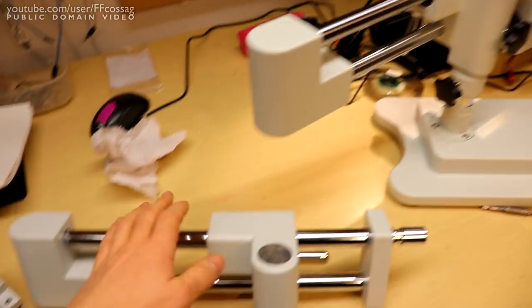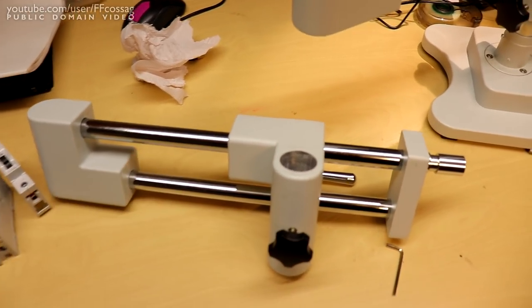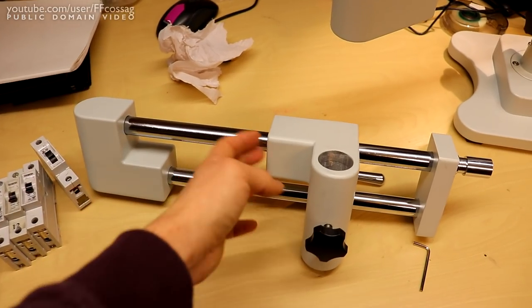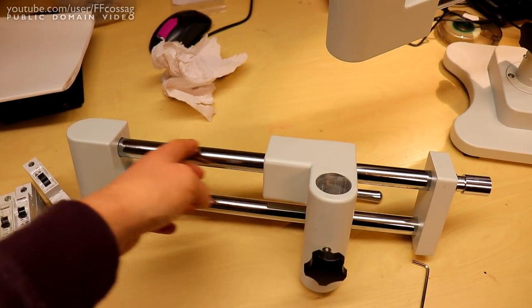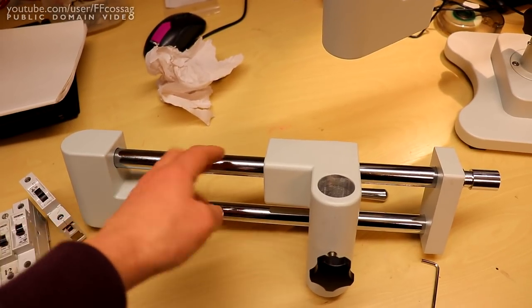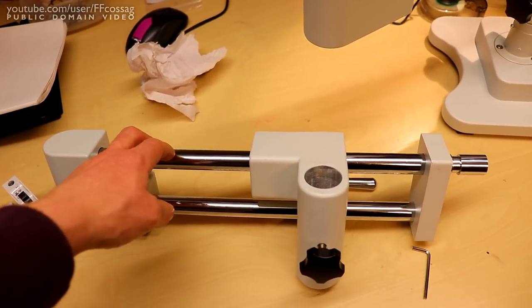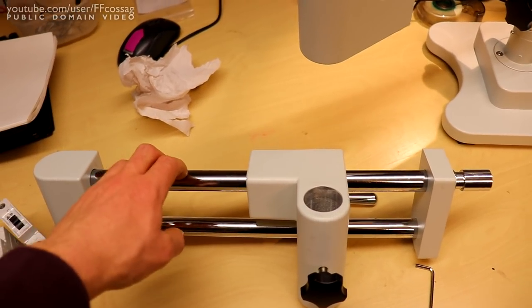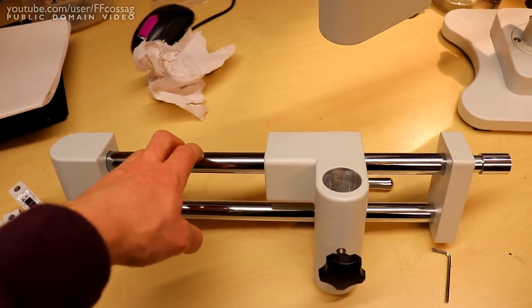I have had one of these microscopes at work which we've had for about two years, and that one actually had pretty decent bearings. It's lasted for about two years now with the original soft metal arm, and it's just now turning really bad.